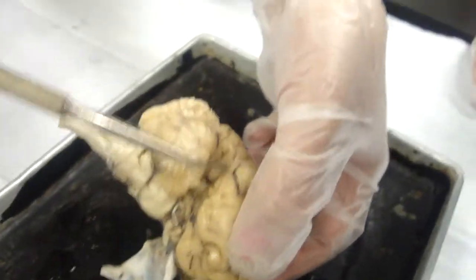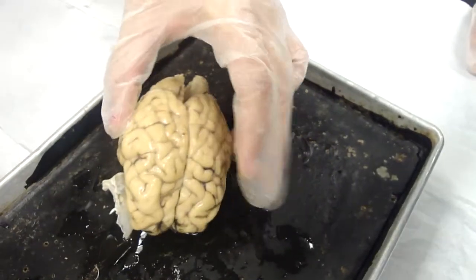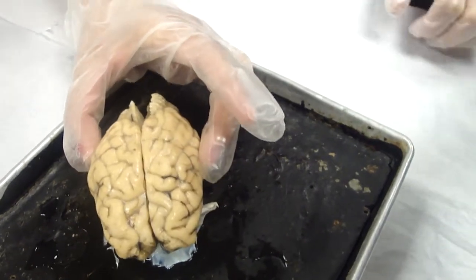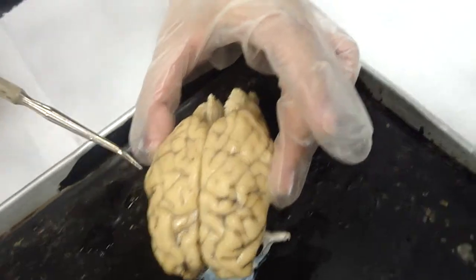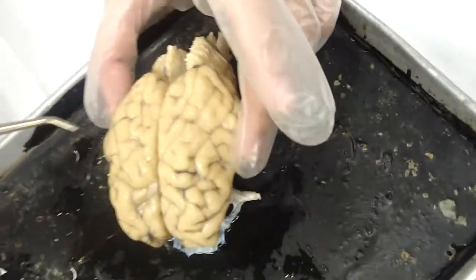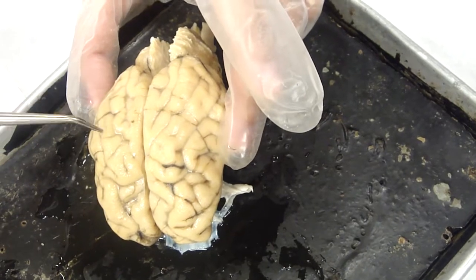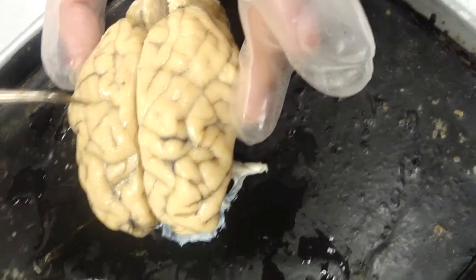There's also a central fissure, which is a little difficult to see on a sheep's brain, but pretty remarkable on a human brain. Basically it's a dividing line between the frontal lobe and the parietal lobe. On this brain, the parts that pop out are known as a gyrus. Not as deep as the other fissures. However, the little tiny grooves between one gyrus and another, this little groove here, is known as a sulcus.